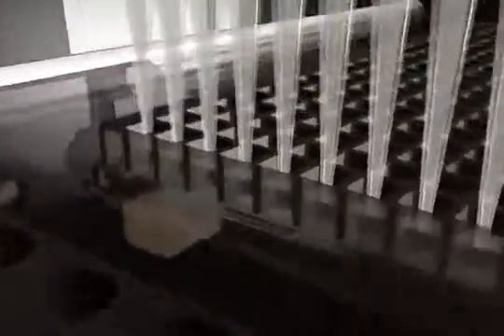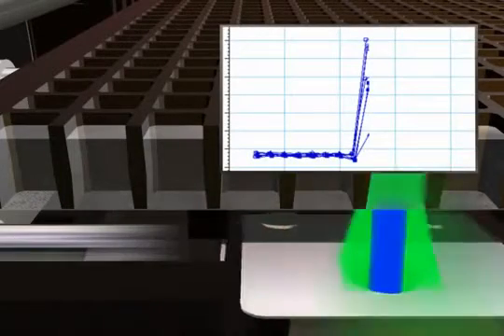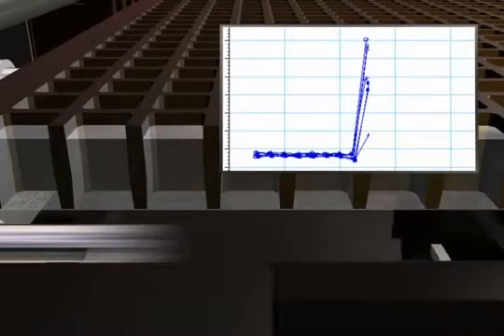You can monitor your assay's response profile in real-time before, during, and after compound transfer to the plate.